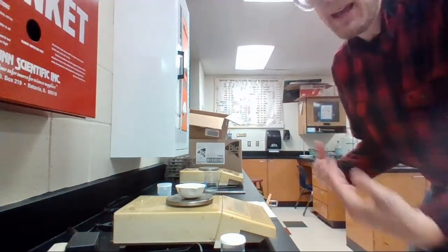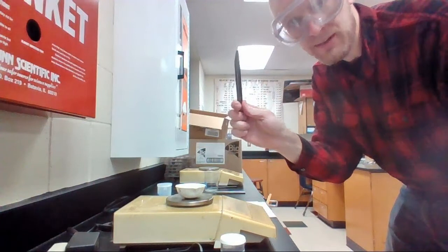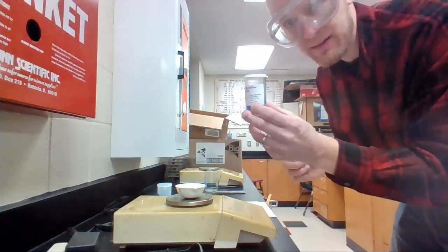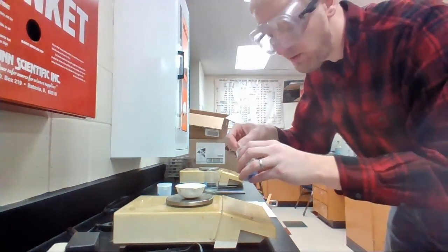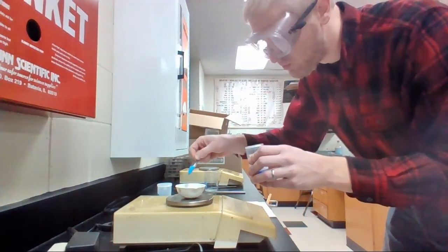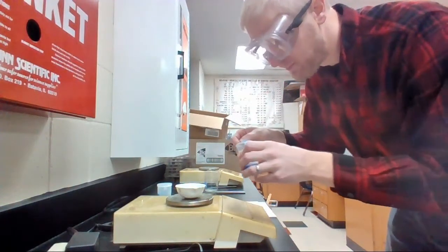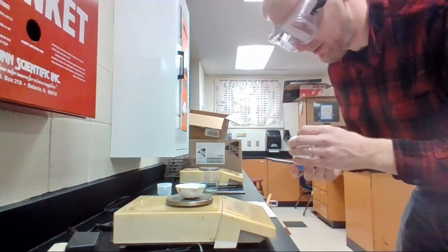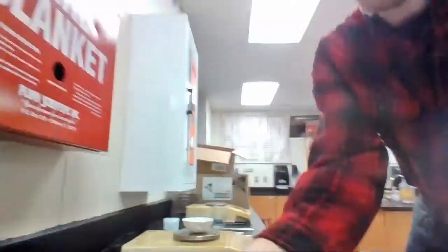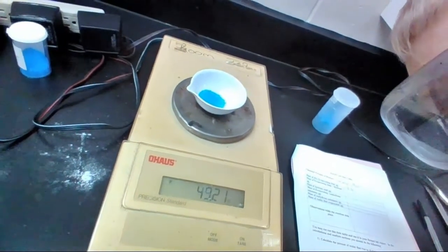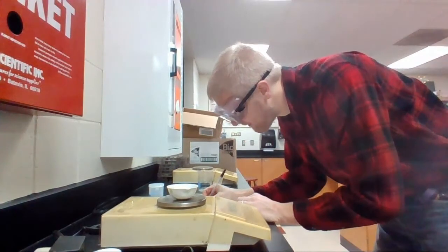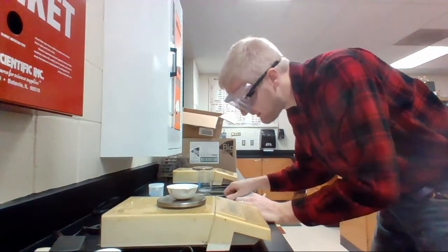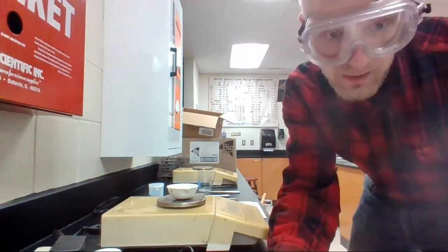Now we've got to do the mass of the hydrate with the dish. Got my scoopula, also known as a lab scoop. Got my hydrate. Look at that. We're going to scoop a little bit. There we go. That was a bit of... There we go. That looks good. There we go. It is now... I'll let you see it. 49.21. All right. 49.21. 49.21. That is the mass of my hydrate with dish.